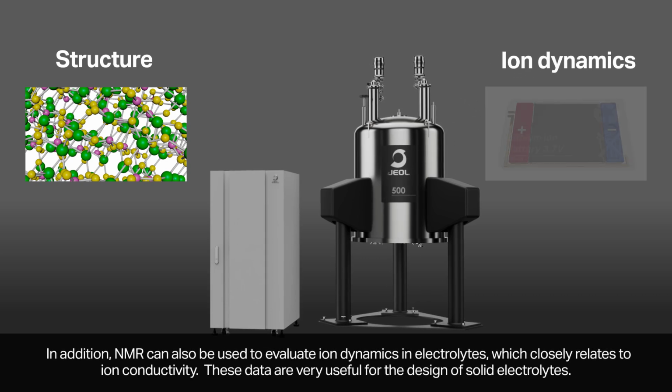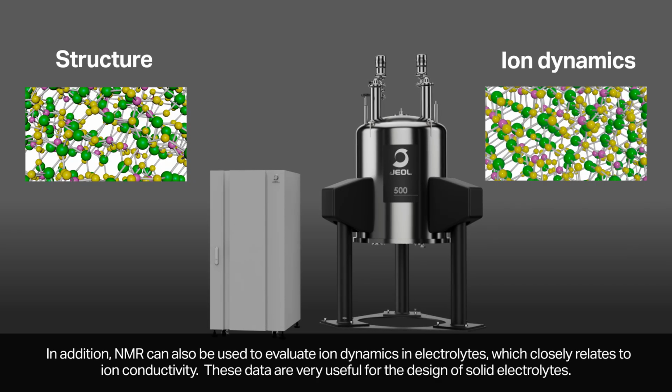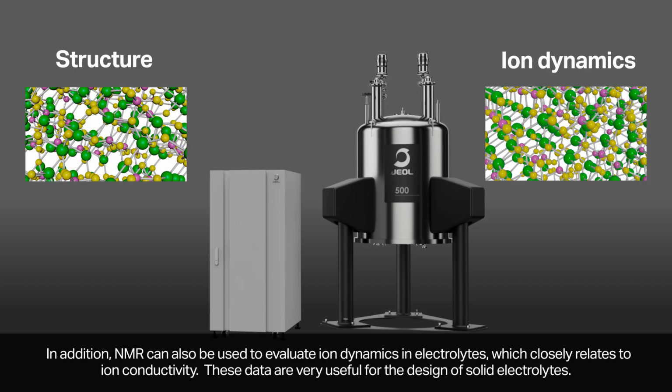In addition, NMR can also be used to evaluate ion dynamics in electrolytes, which closely relates to ion conductivity. These data are very useful for the design of solid electrolytes.